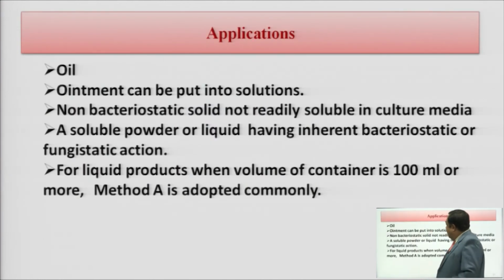Applications: oil, ointment, non-bacteriostatic solid, a soluble powder or liquid, having inherent bacteriostatic or fungistatic action. For liquid products, when the volume of the container is 100 ml or more, this particular method is very commonly used.